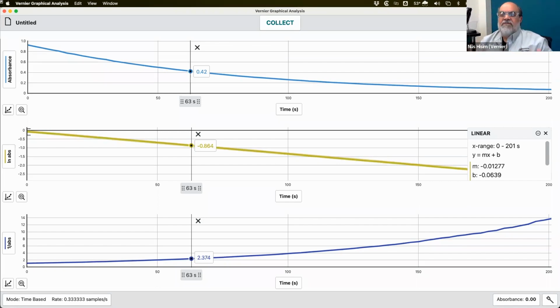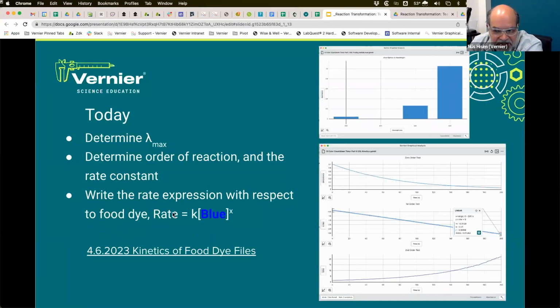One of the things they have to have is a rate constant that makes it so that you actually end up with a rate. So a rate is molarity per second, and absorbance can stand for that because it's first order and directly proportional. But if you look at the right side of the equal sign, you've got molarity times k. How do we get molarity per second?